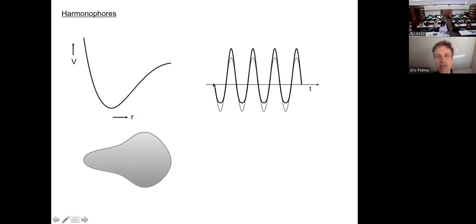And that means on one side, here on this side, it's harder to pull them out, and therefore it's truncated. But on the other side of the waveform, here, it's easier to pull them out. So I get this sinusoid that almost looks the same, but it has a slight modification. On one end, it's pulled out. On the other side, it's held back. So this black line is the polarization you create.